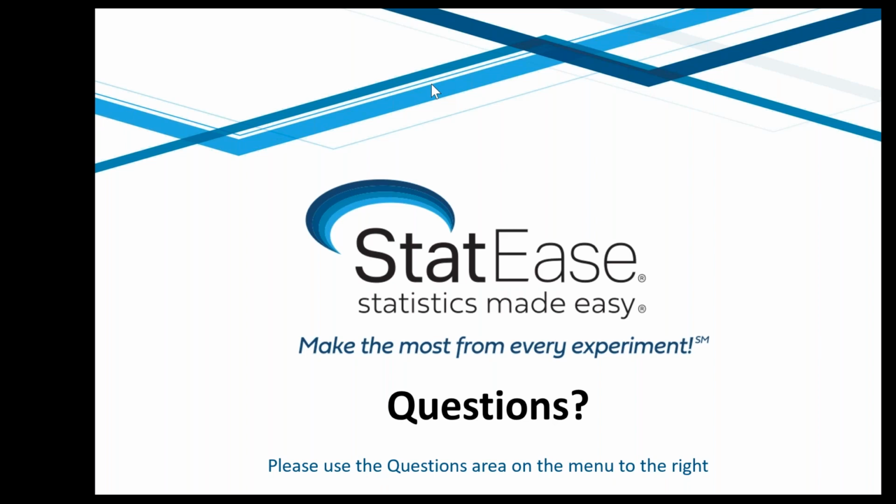Okay, great. We have Manpreet Bhatti asks, is it simple PCA or Varimax rotation applied? How many columns and rows were there? And factor analysis based on scree plot can give better results. Any comments? Can you repeat the last part of the question? Factor analysis based on scree plot can give better results. Any comments? Okay, I have to admit I don't know this technique.